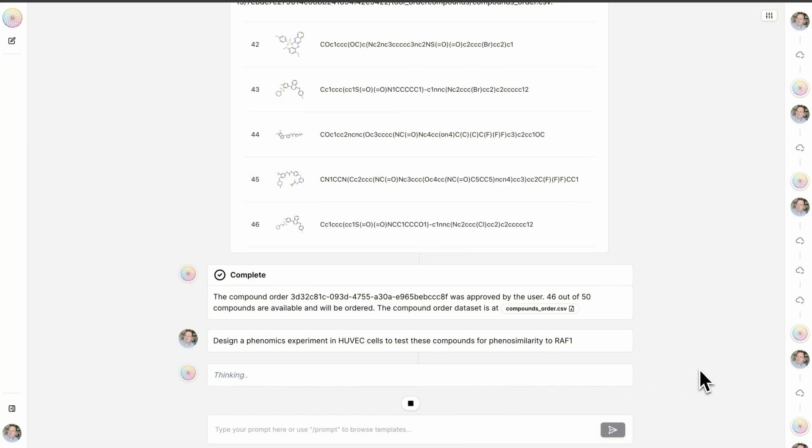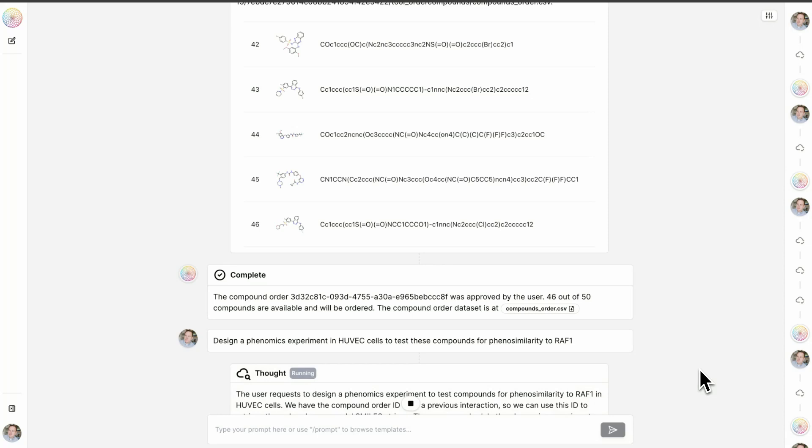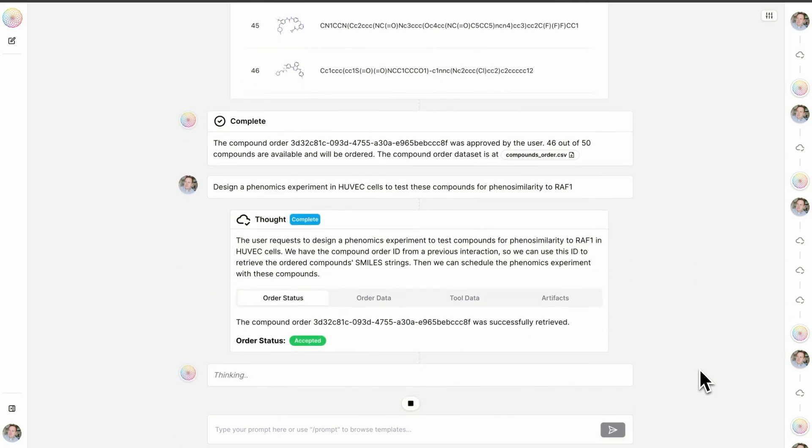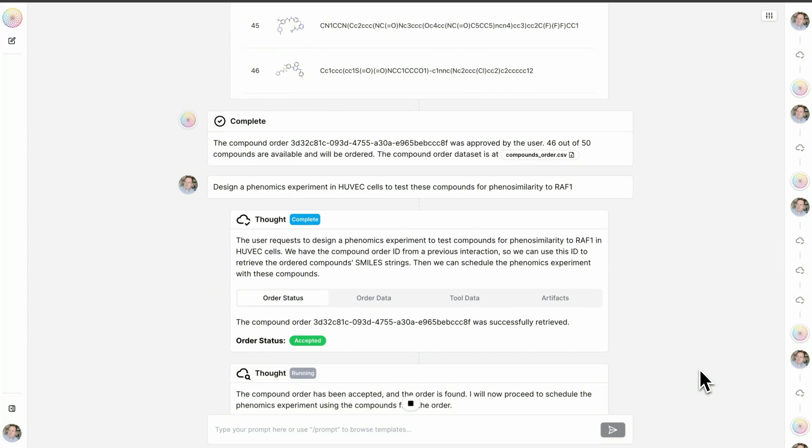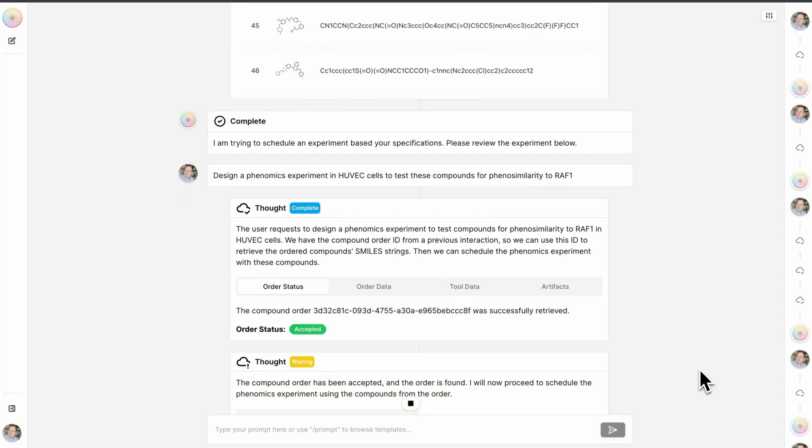I've used Lowe to call an API to our experimental design tool. This tool has been built to make sure that when we run an experiment, we run it not only to ask and answer the question that the user intends—are these compounds phenosimilar to a knockout of RAF1—but to make sure that we're generating all of the proper control data to make sure that everything we do here will be useful in every experiment we do in the future.